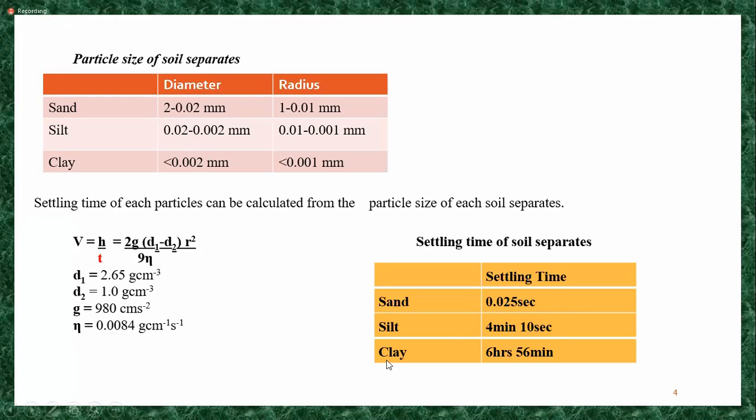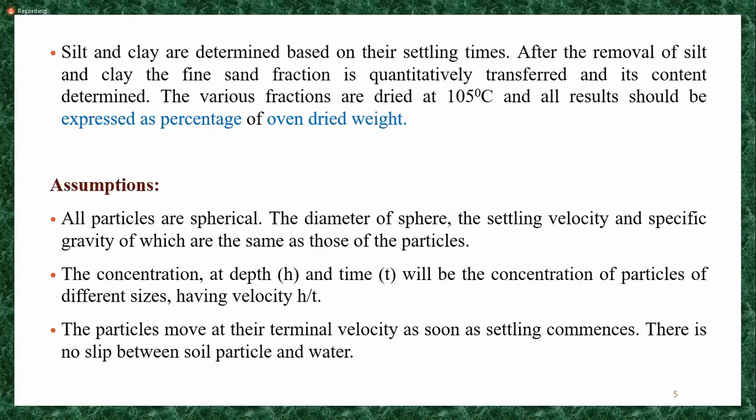Settling time is very short for sandy soil, and it takes around 6 or 7 hours for clay particles to settle down. These things you have to remember.